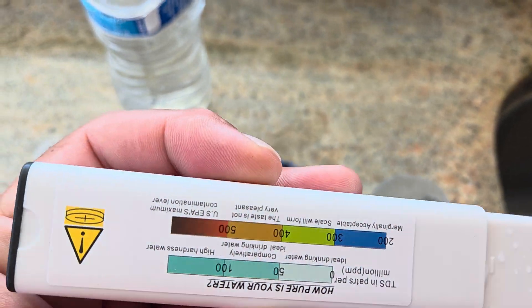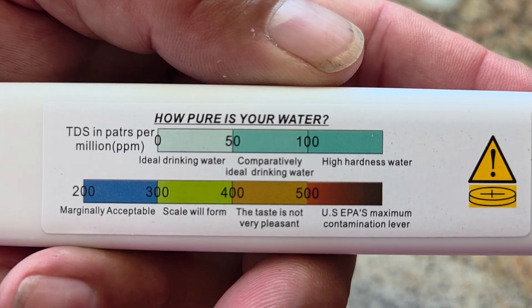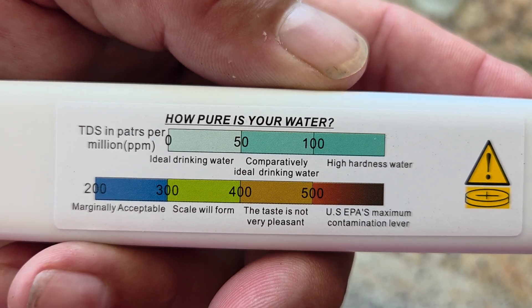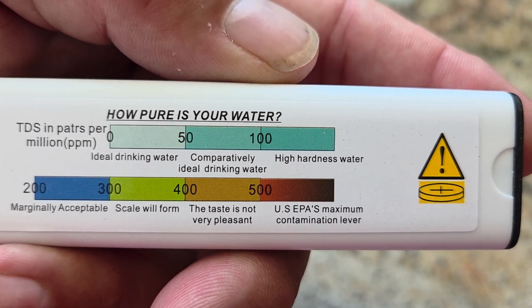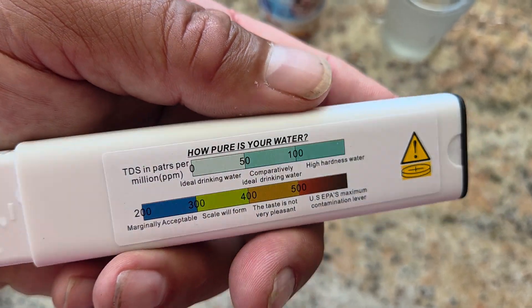So if you flip it over on the back, it's got a scale. You can see 0 to 50 is good, 0 to 100 is still good, 0 to 150 is still good. Anything 200 and over, well, it starts to get a little questionable.